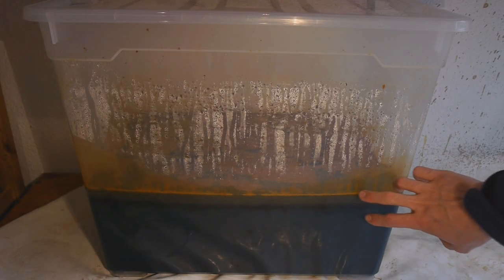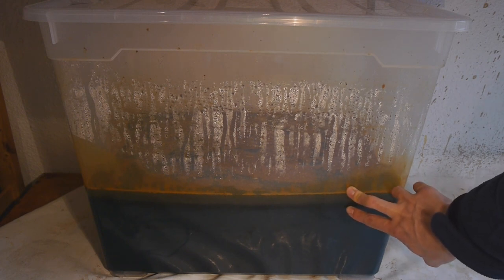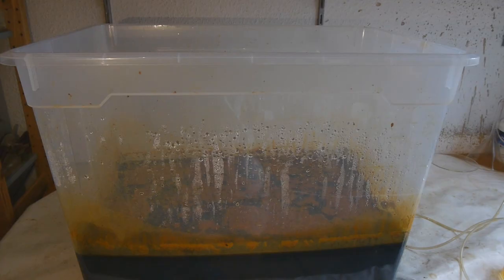This is now about 3 days later, and you can see the iron hydroxide has settled out about this much. So I'm just going to insert a plastic tube right here. And now we can just suck out the water using a syringe. I've now siphoned out as much water as possible.